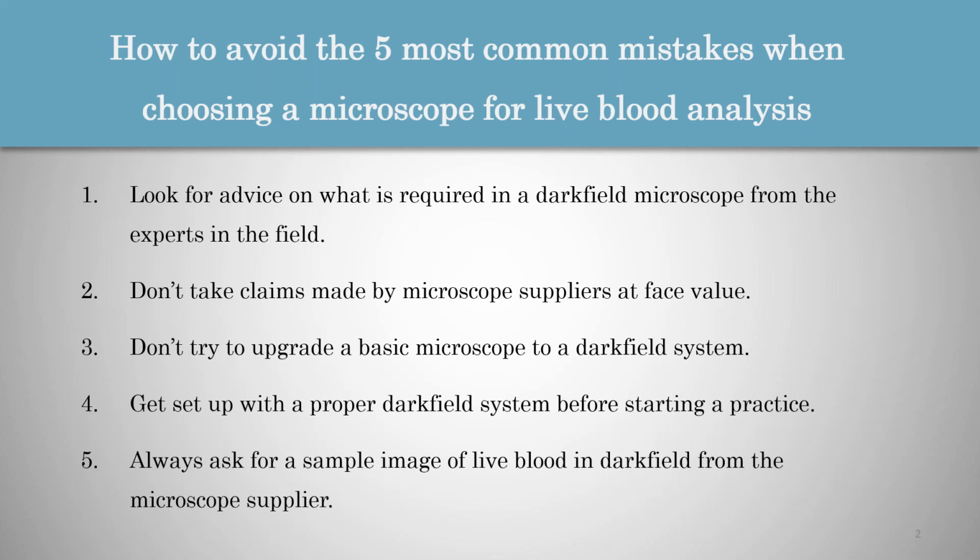And the costs of these other microscopes are a fraction of what the professional systems go for. So it really is quite tempting, but unfortunately once you have a microscope like that, and it's not suitable for what you're trying to use it for, it's quite difficult to work with something like that. And then one would have to decide if you're going to keep it and compromise some of the results that you might be getting in practice, or if you would try and sell it to someone else.